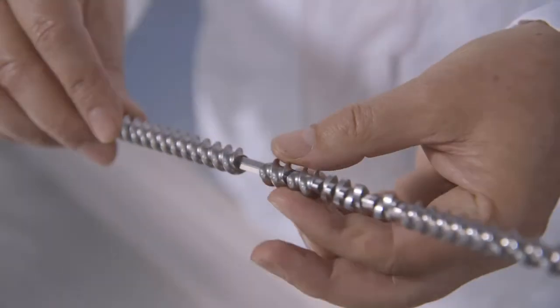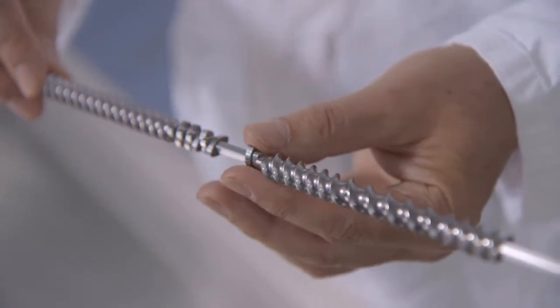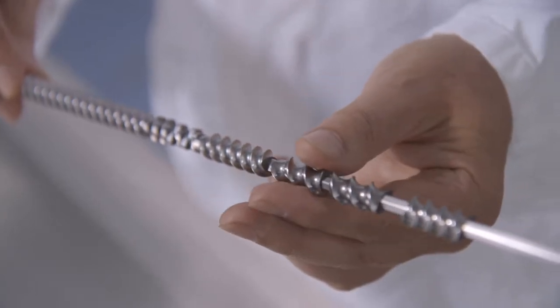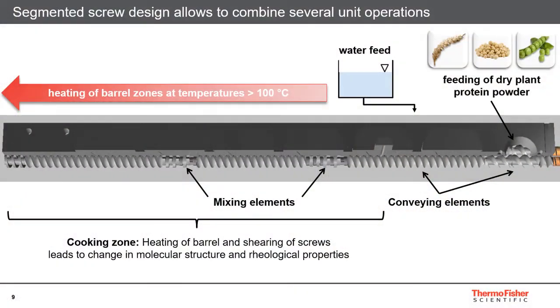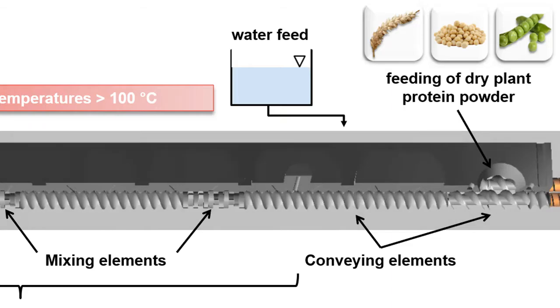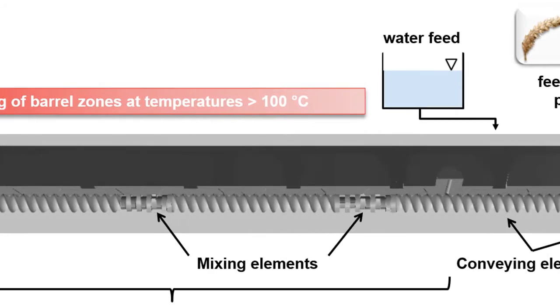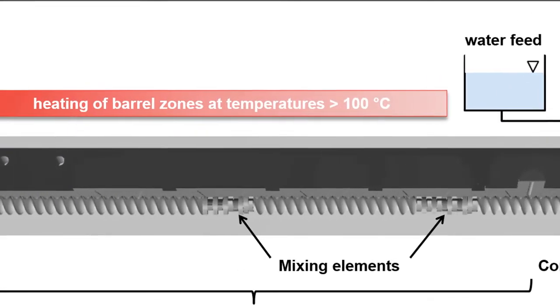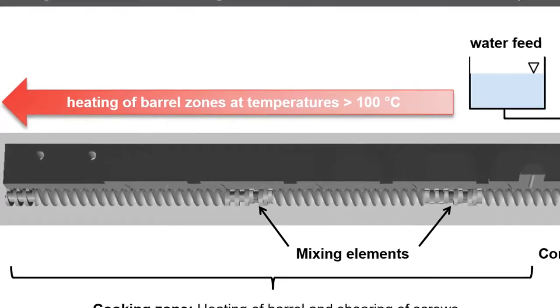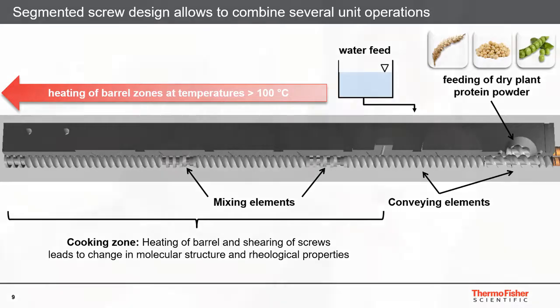When this material is fed into the extruder, it will be taken by these parallel co-rotating screws. These screws, as you can see, consist of single elements that can be assembled together in order to conduct certain unit operations, and this special food screw design is assembled in a way that you can use it to feed material, first of all with wide throat elements that allow you to transport the material fast away from the material intake. Then it will be transported by the rotation of the screw along to the mixing zones, where the material is mixed, kneaded, and undergoes certain changes in its molecular structure, which are required to achieve the product properties of the muscle meat-like product. And then at the end of the extruder, the material will flow into the cooling die.